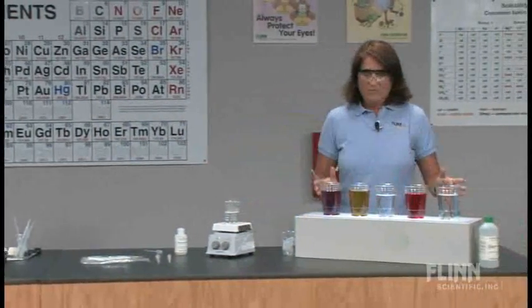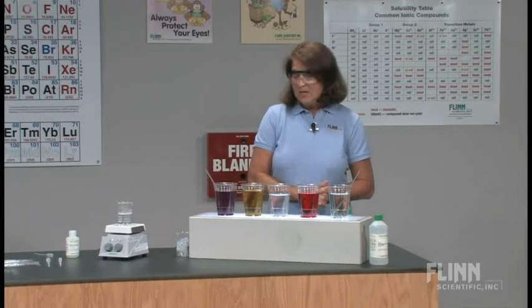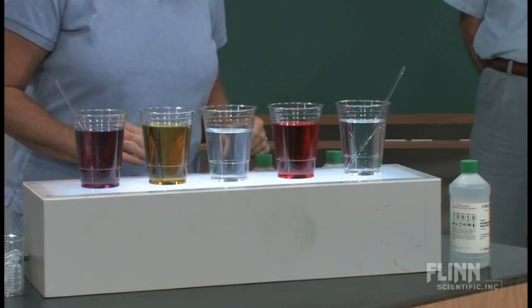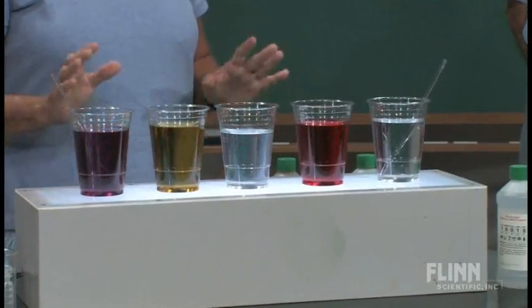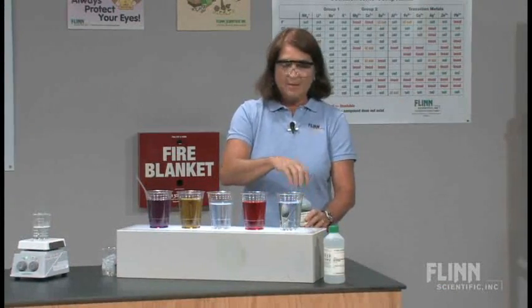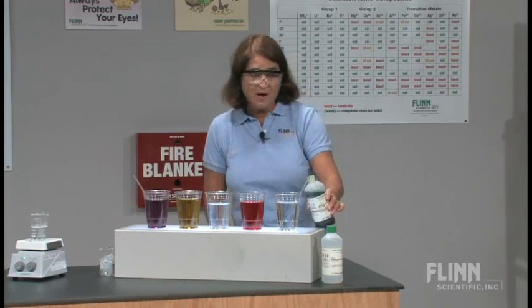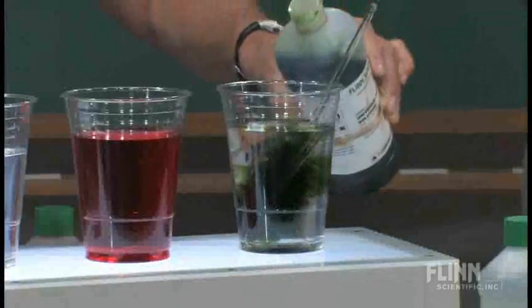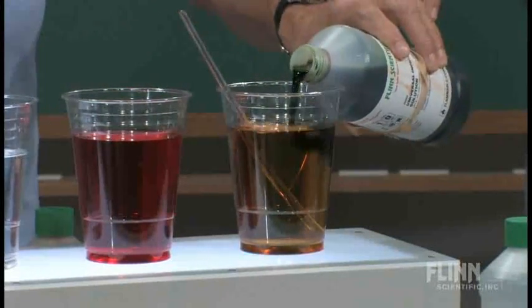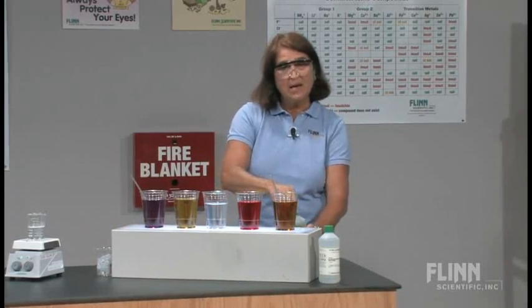What I have here — I would do this in my classroom with beakers — are five different solutions. To each of these cups of water, I have added an indicator. I'm not going to tell you which indicator I've got right now. I'm going to add a universal indicator. I want my colors to be vibrant, so I'm just going to pour in a little universal and give a quick stir. I always say more is better — pour in a little universal, give a quick stir. The color tells me something about the pH of my solution.